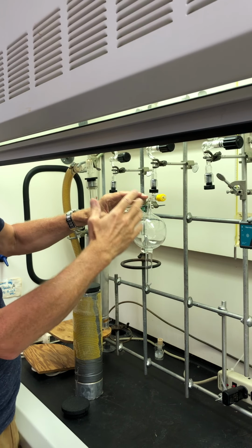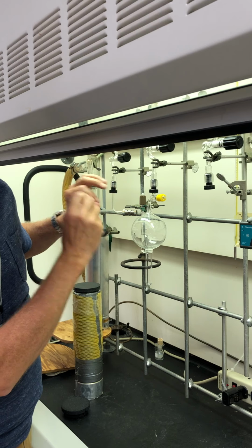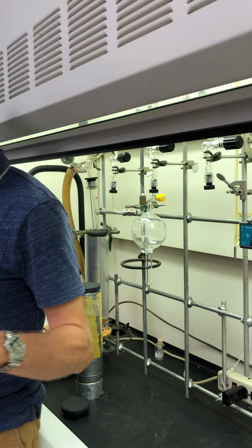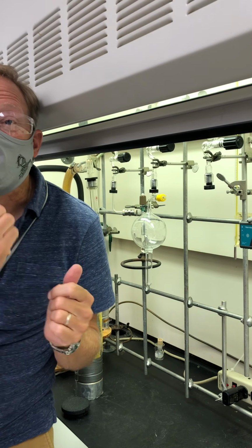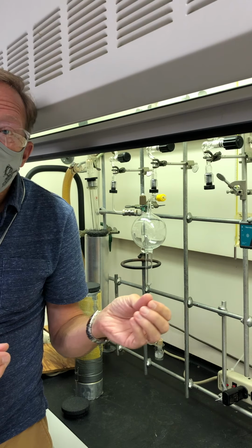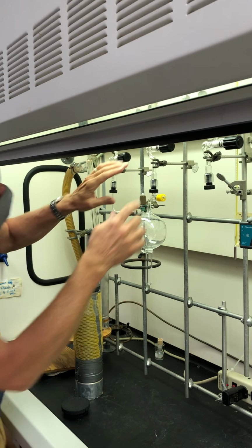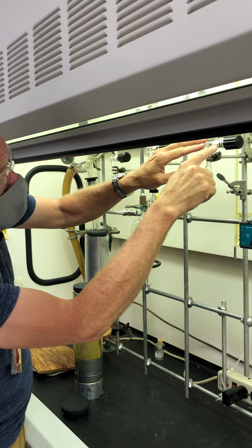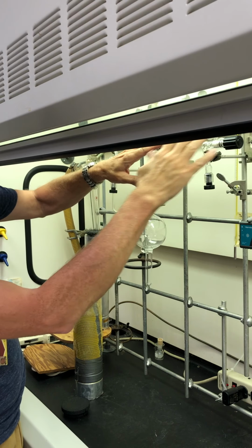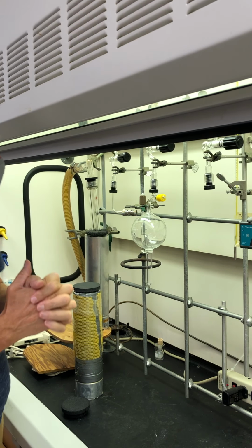And we'll be able to determine the pressure that's in that bulb of a certain amount of vapor. Then next door in the lab we have a balance set up that you can weigh the bulb on and see how much more mass there is when you have a known pressure in there. This is valve C. We can open that if we want to determine what the pressure in the lab is. And here on this end we have the pressure sensor, which is a Bluetooth device.